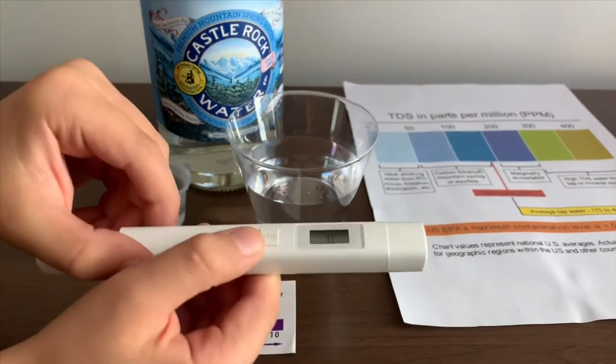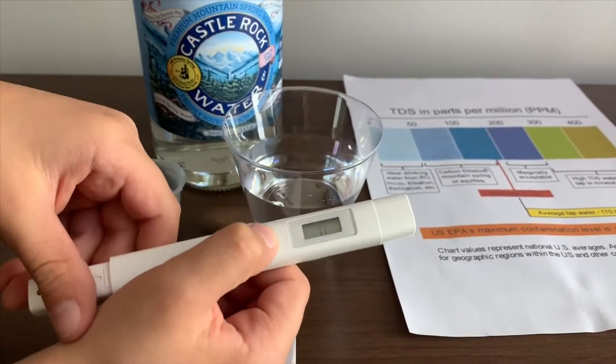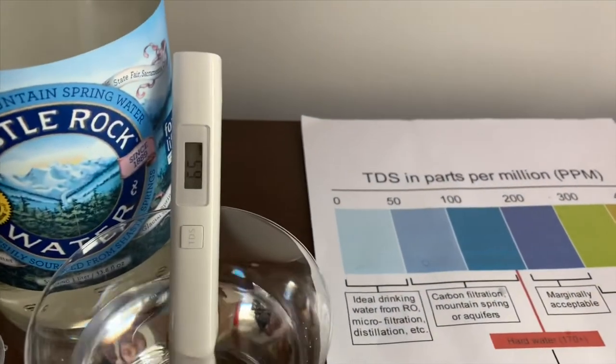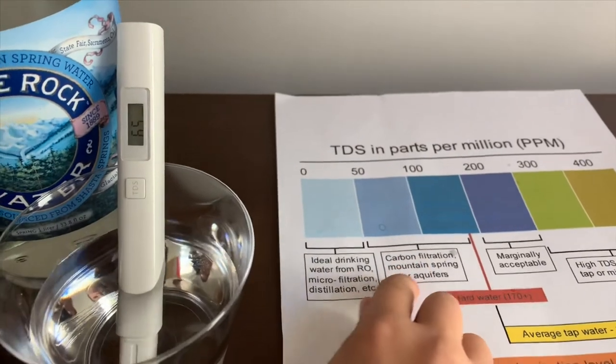If you want to buy this TDS tester, check the link down below. Turn on the TDS tester, make sure it says 0, and put it in. 65. That is okay to drink.